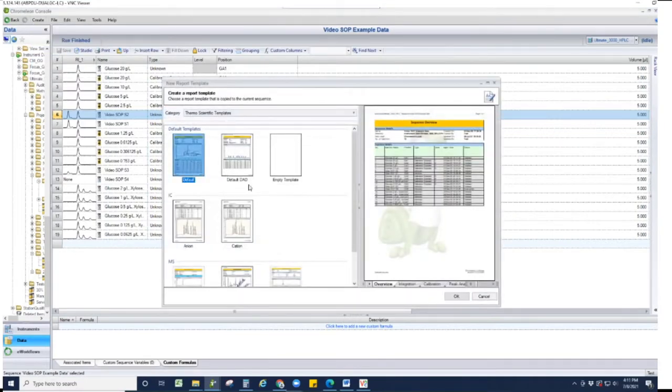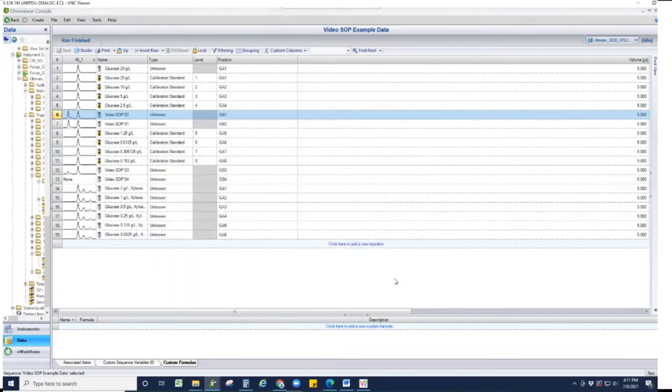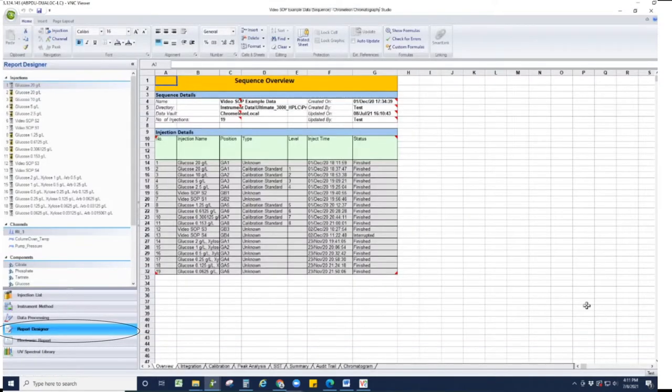Select the desired predefined template and then select Next. Enter a report template name and file location and select Finish. If you are in the Studio Viewer, you can create a report template using the tab on the bottom left-hand side of the screen.